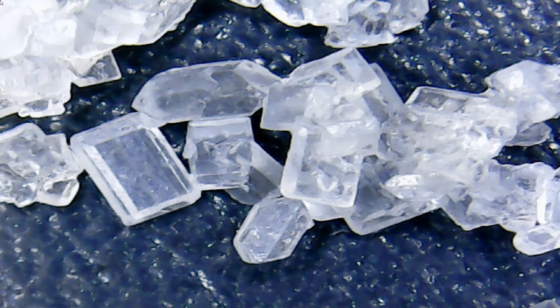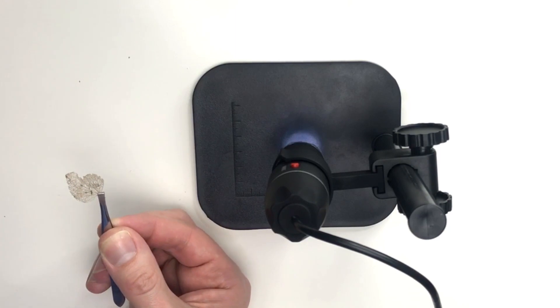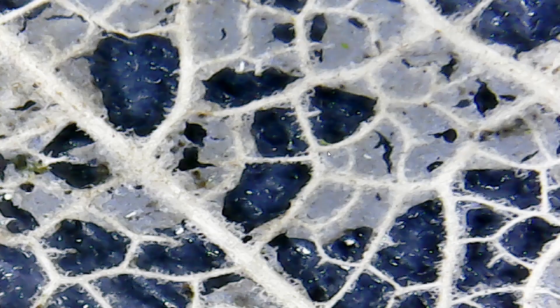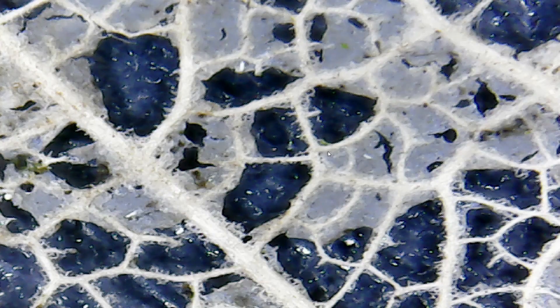Don't forget, I mean we see sugar every day, but when you look at it like that it just looks like something from a totally different world. Now the next thing on the agenda is this — which is the leaf, or should I say skeleton of a leaf. Whoa, look at that! It actually looks like a miniature city, maybe with some lakes, but plenty of roads intertwining with each other.